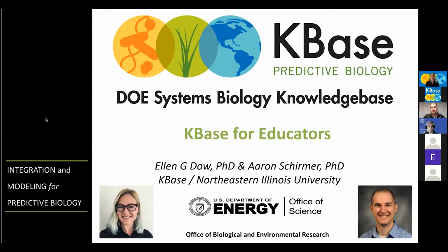And so the reason this came about was because we realized that the narrative is a unique resource. It is essentially built on top of a reproducible Jupyter notebook instance. And so this Docker image is shareable so that someone can see exactly what research you are doing, from data to results, including any analysis, as well as different notes and conclusions that you come to.